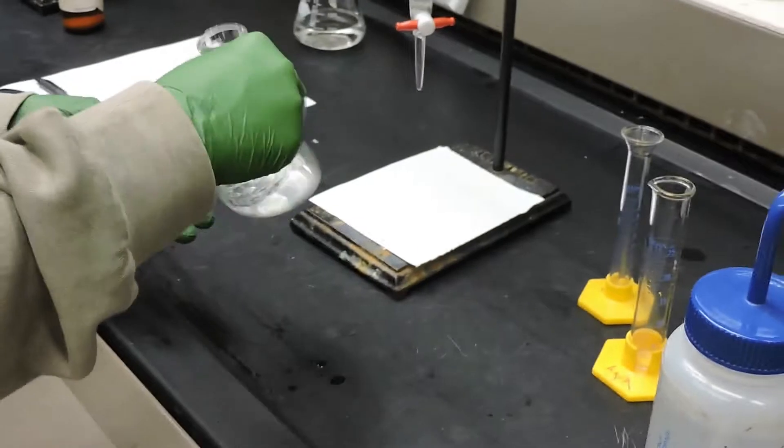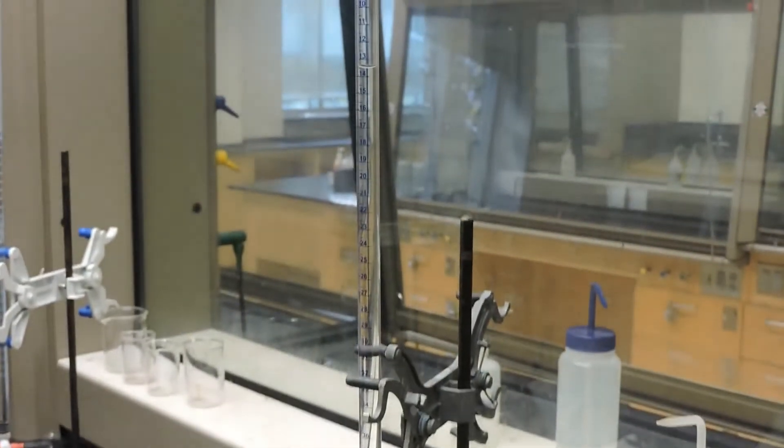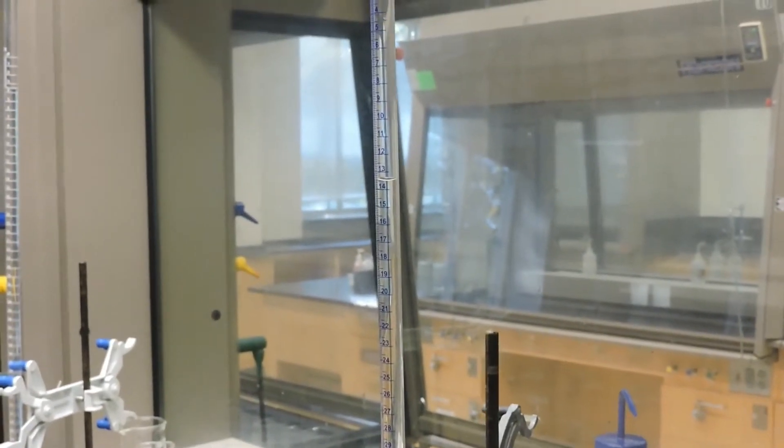The initial volume of the burette sodium hydroxide solution is the same as the final volume of trial one, which is 13.50 milliliters. Now we will begin to slowly titrate.